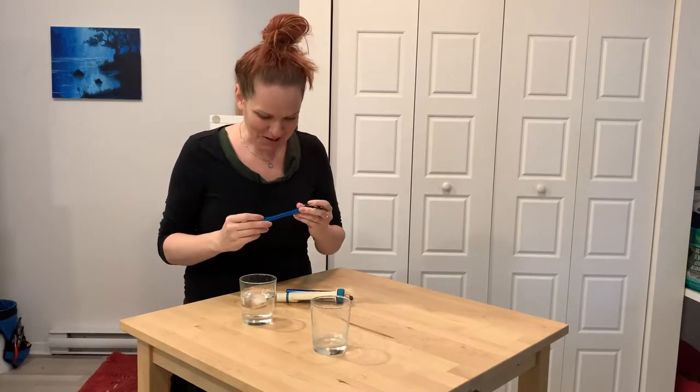Hi everyone, I'm Kat from Water Rangers and today we're going to be looking at our stream thermometer.